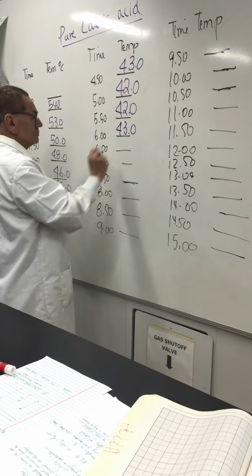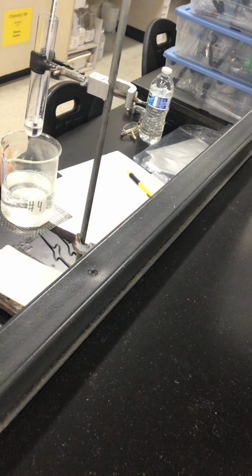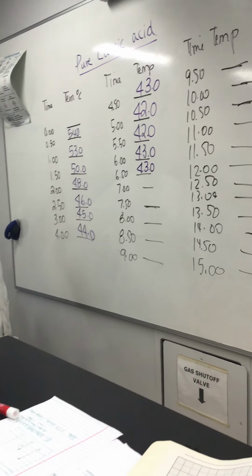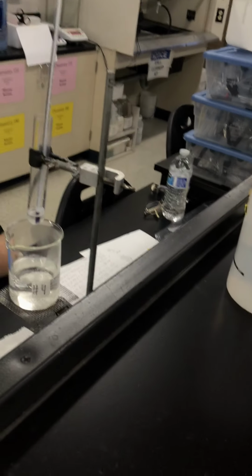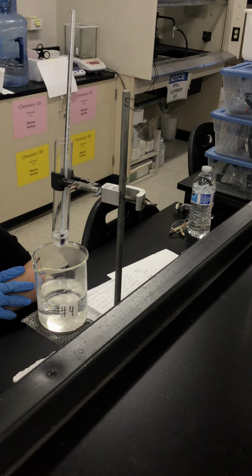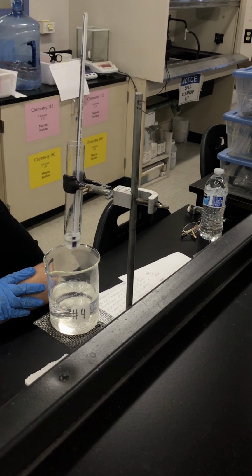Yes, it went up one. I don't know why it went up. Again, 43.